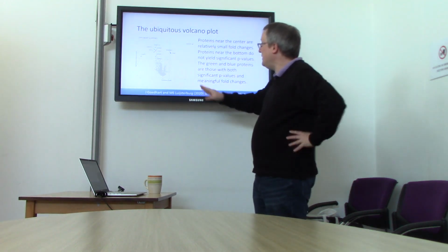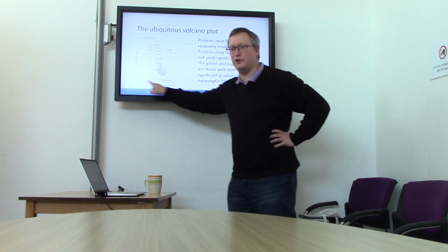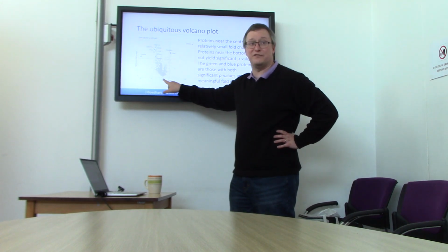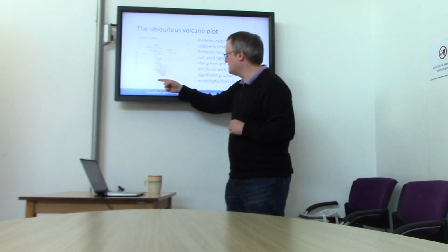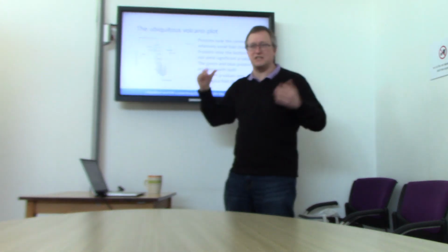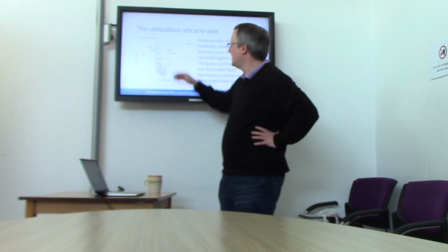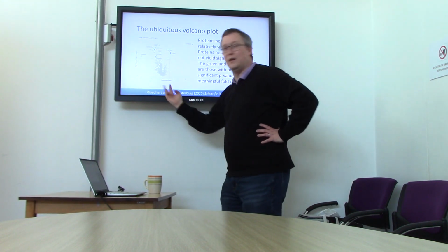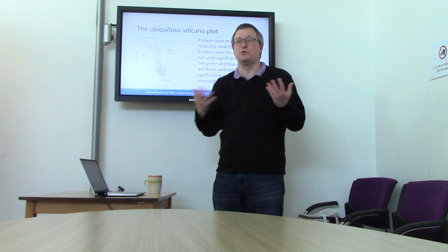So what we have is a plot in which we have a fold change, here called enrichment, on log scale. When I see a value of 0 on a log scale, I remember that means 1 to 1. So this means way up in controls, this means way up in cases, let's say. If it's in the middle, that means there's no fold change between the two. So anything that falls in this central column of the figure, essentially it's not a very big fold change.